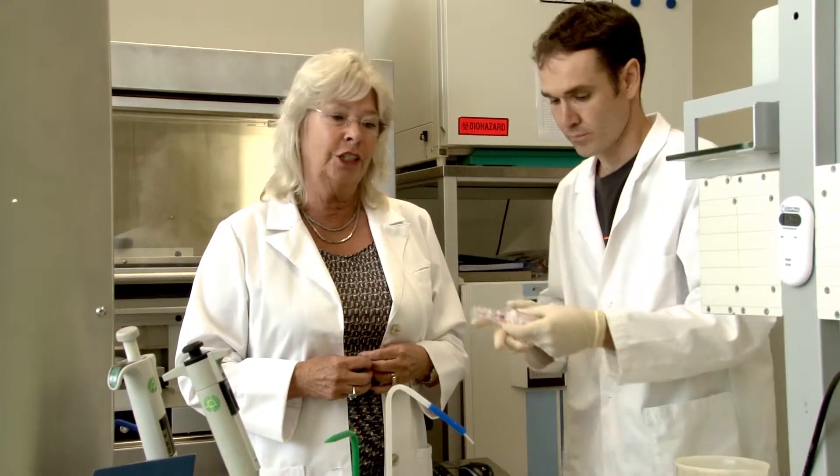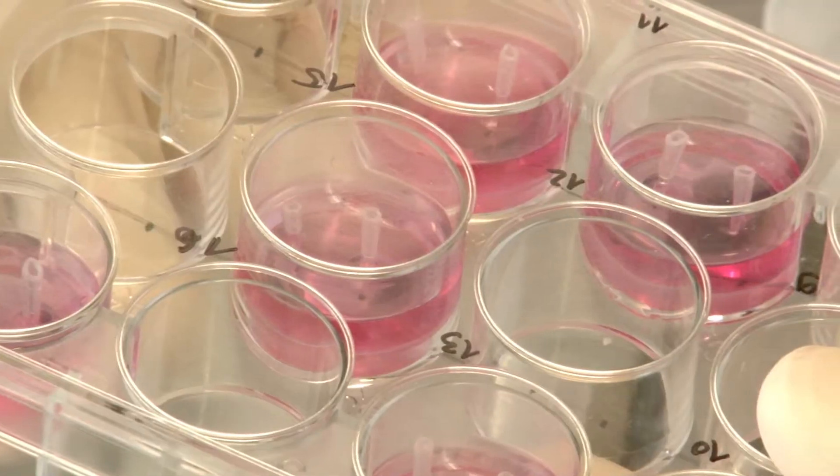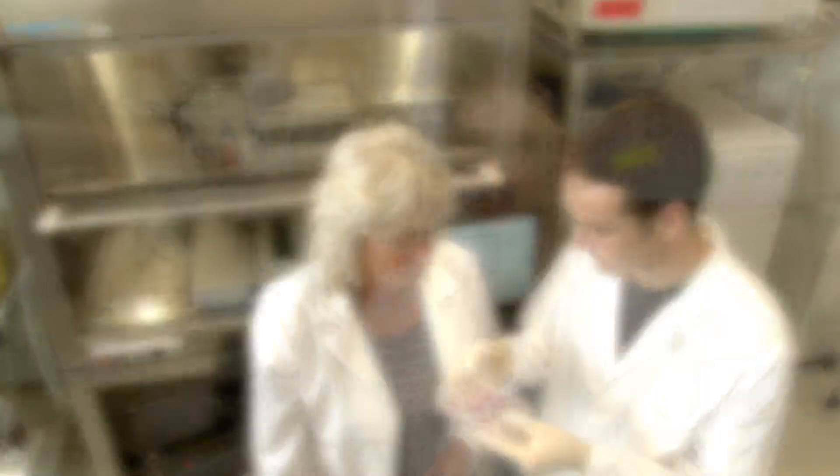We aim to generate highly complex organ-like tissue models for drug development and substance testing by bioprinting technology. The bioprinter is based on a flexible and modular concept in order to adapt the instrument's performance to the user requirements.